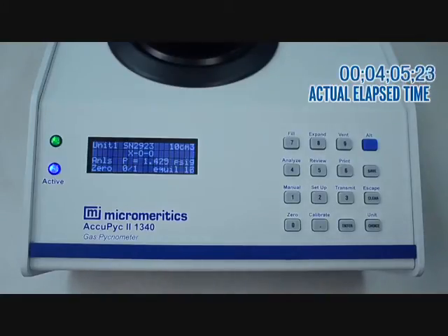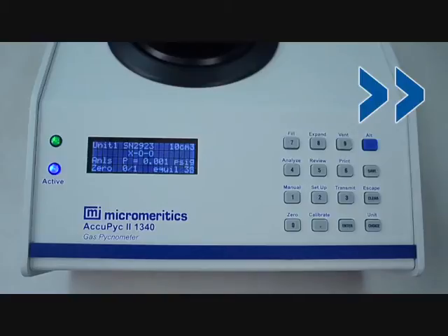The unit starts filling the chamber for analysis. The LED shows the pressure. The expansion valve will open, followed by the vent valve. The unit will equilibrate again. Now the analysis cycle starts by filling, equilibrating, and expanding, equilibrating again, and then venting back to zero pressure.